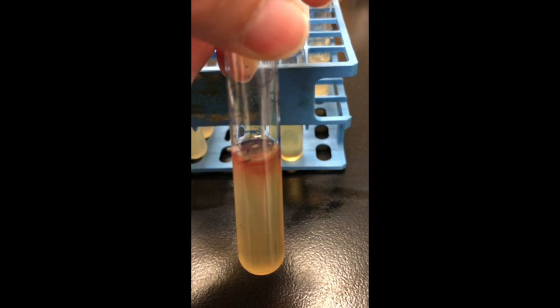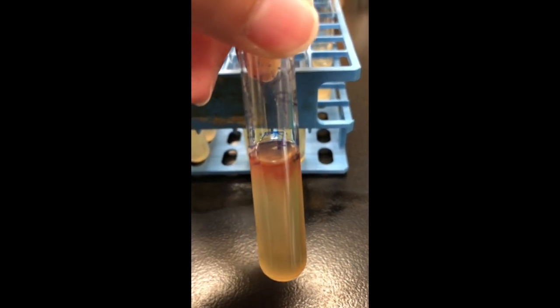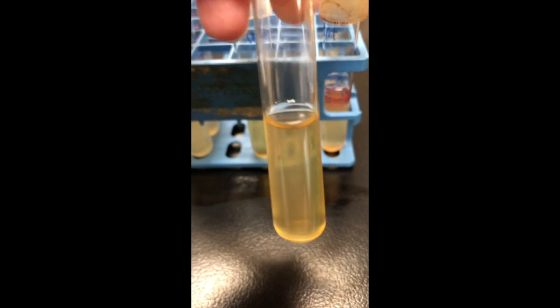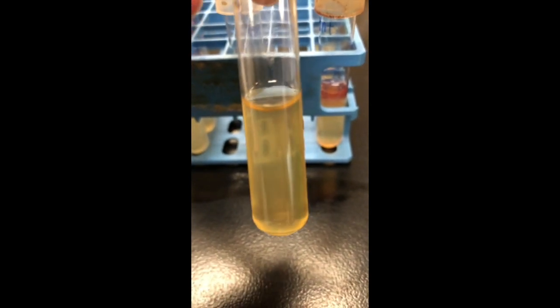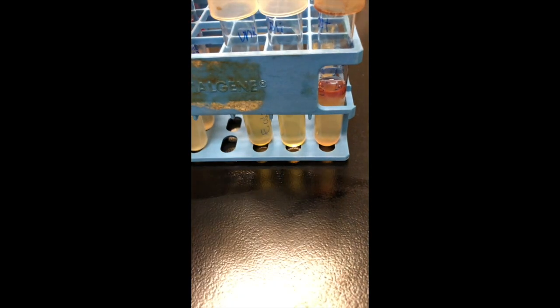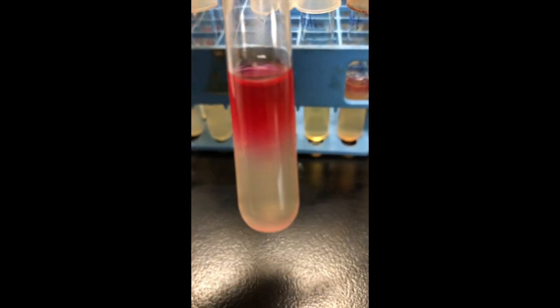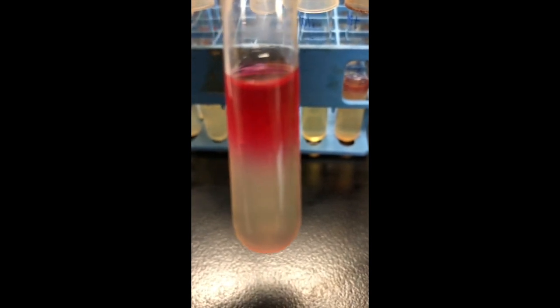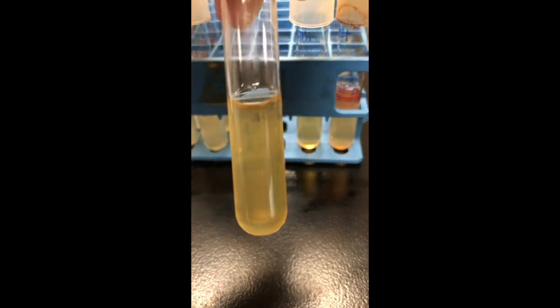Now we're going to check out our VP tubes. Notice our Enterobacter has a nice red layer at the top. This shows me that this organism can utilize butanediol or acetoin. Our E. coli stayed clear or yellow, so this tells me that we prefer a different pathway. And if you remember our MR test, our E. coli was bright red. So this shows me that E. coli prefers the mixed acid pathway instead of the butanediol pathway. Here's your unknown. You tell me, what do you think?